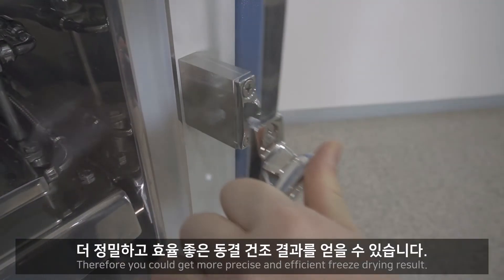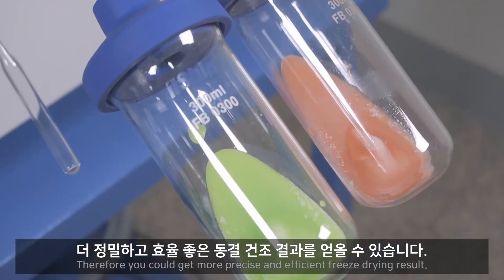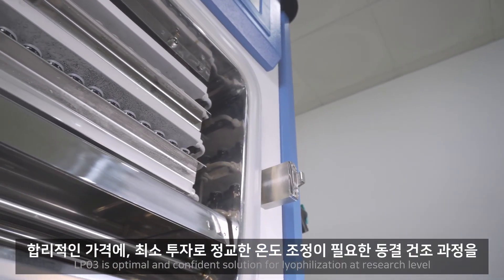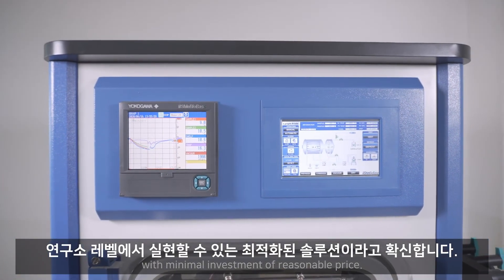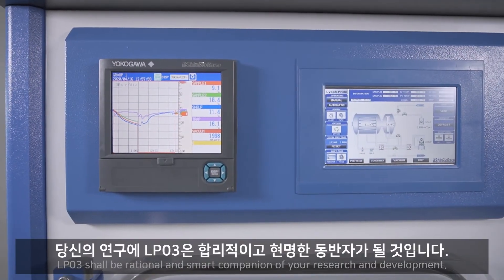Therefore, you can achieve more precise and efficient freeze drying results. LP03 is the optimal and confident solution for lyophilization at a research level with minimal investment at a reasonable price. LP03 shall be a rational and smart companion for your research and development.